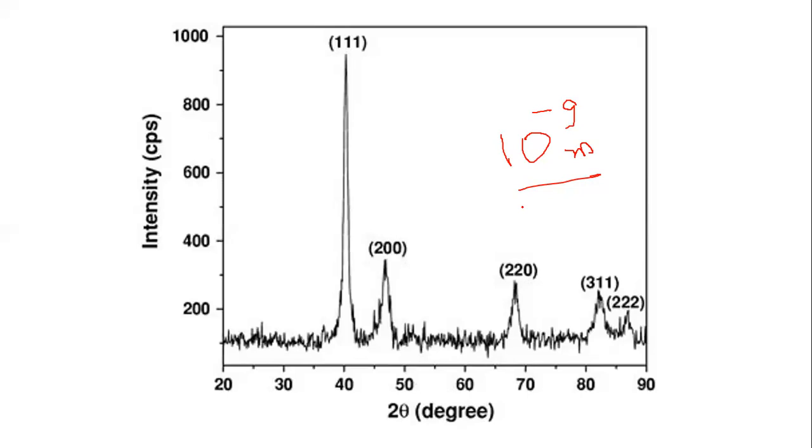So there is a lot of interesting information. And you know that we cannot see a particle of 10 raised to the power minus 9 meter. In the nano range, we cannot see the particles. We already studied in quantum mechanics the nano range and angstrom. So in the nano range, we cannot see, but still we can 100% confirm whether it is crystalline or amorphous in nature. So just looking at the spectra, you can understand.